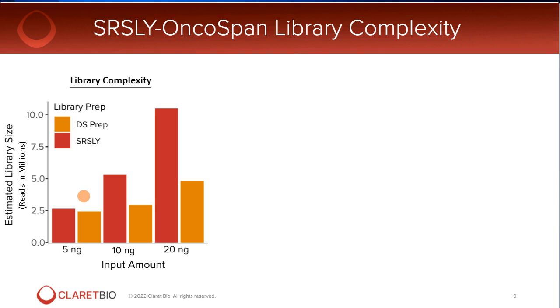And then on the y-axis, the estimated library size. This would be the total library size of the enriched panel, so over the 800 kb panel, the amount of reads that would be there if everything was sequenced to completion. This is just a standard output in one of the Picard tools, the Picard tools estimate library size.